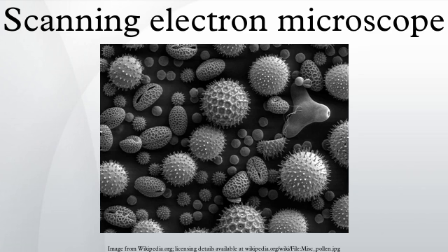Color. The most common configuration for an SEM produces a single value per pixel, with the results usually rendered as black and white images. However, often these images are then colorized, in either true color or false color, by using a color lookup table, through the use of feature detection software, or simply by hand editing using a graphics editor. This is usually for aesthetic effect, for clarifying structure, or for adding a realistic appearance to the sample, and generally does not add information about the specimen.